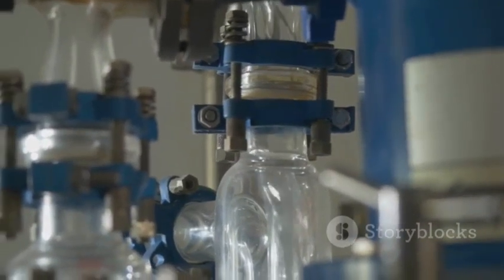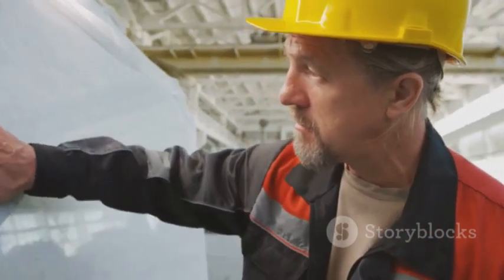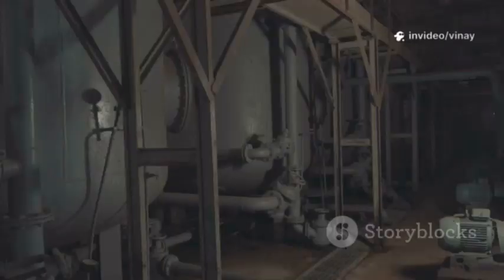They measure the slow movement of gas molecules through a liquid-wetted filter membrane at a pressure below the bubble point. This movement, as we discussed, is called diffusion. The goal for both tests is to confirm that the filter is structurally sound and doesn't have any holes or defects that would allow for bulk flow of gas. So, what's the difference? The main distinction often comes down to the size of the filter system being tested.